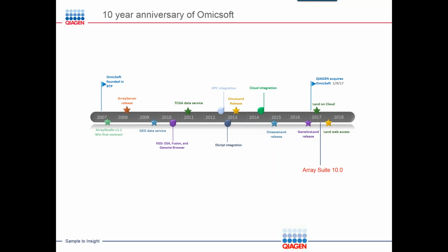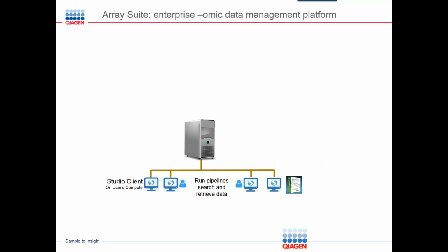So this is quite a journey for the Omicsoft members and also for myself. I just wanted to use this to demonstrate that for the last 10 years, Omicsoft and later on QIAGEN Bioinformatics will continue to listen to our customers and deliver features and data service for our customers.